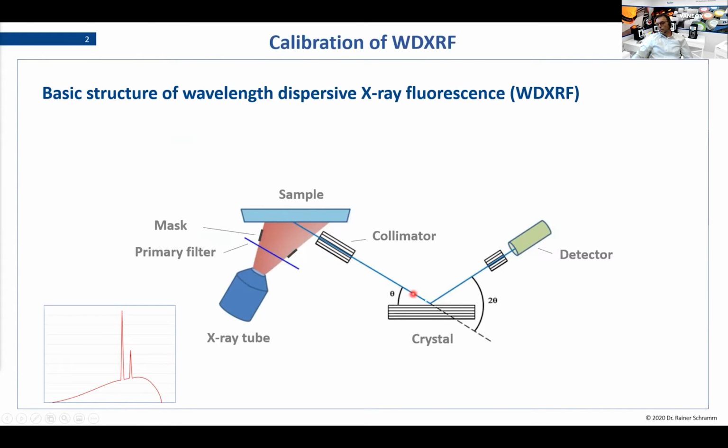And then we have this detection principle over a goniometer, which is watching the sample. And like I told you already, the goniometer is produced in a way that it just takes one single wavelength, so that in the end, when we look at the result, we get such kind of scan, which then shows the line.